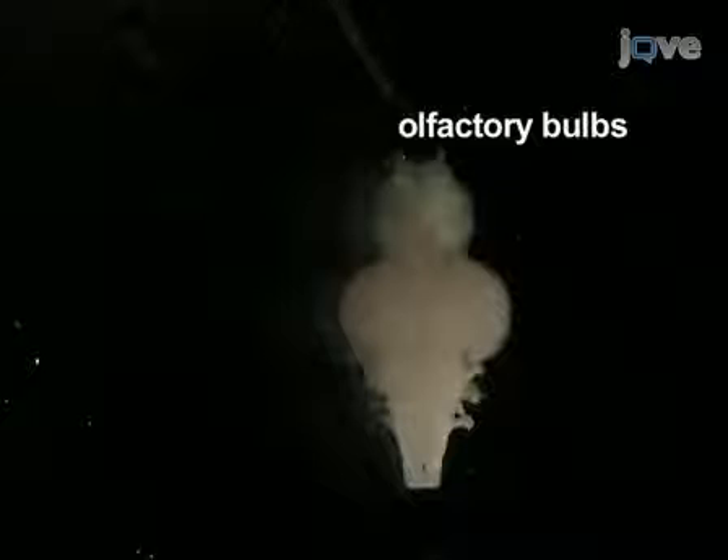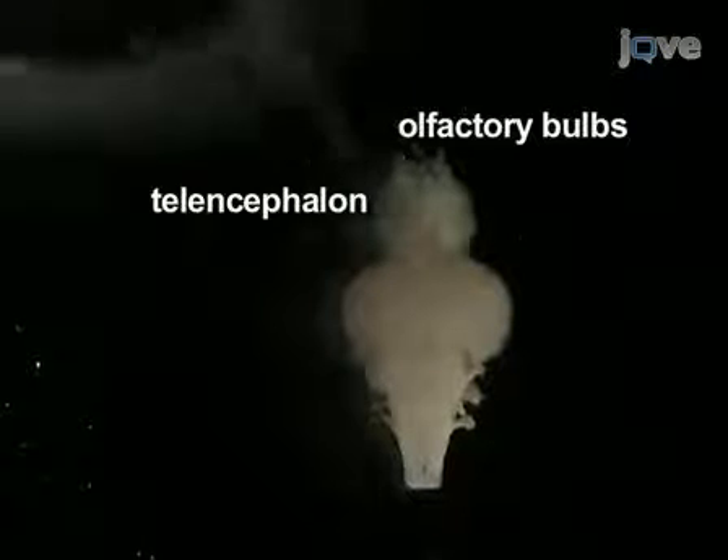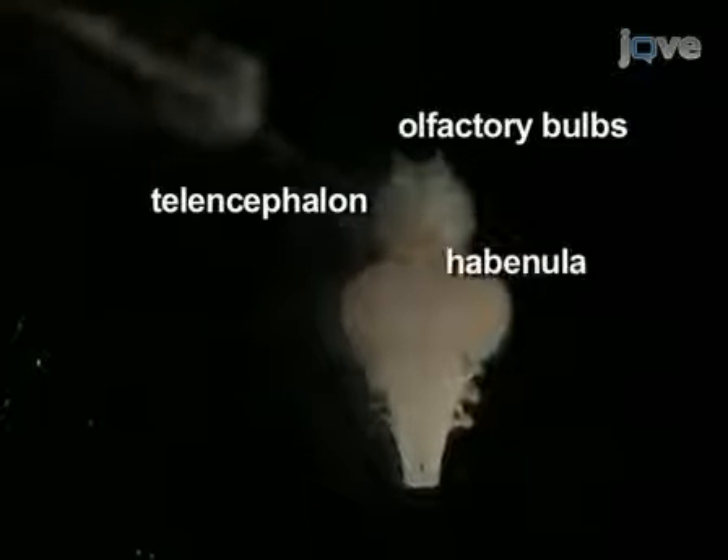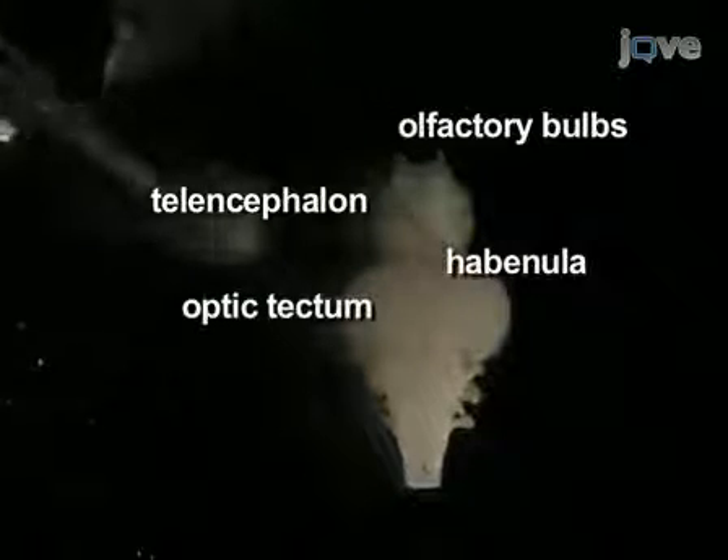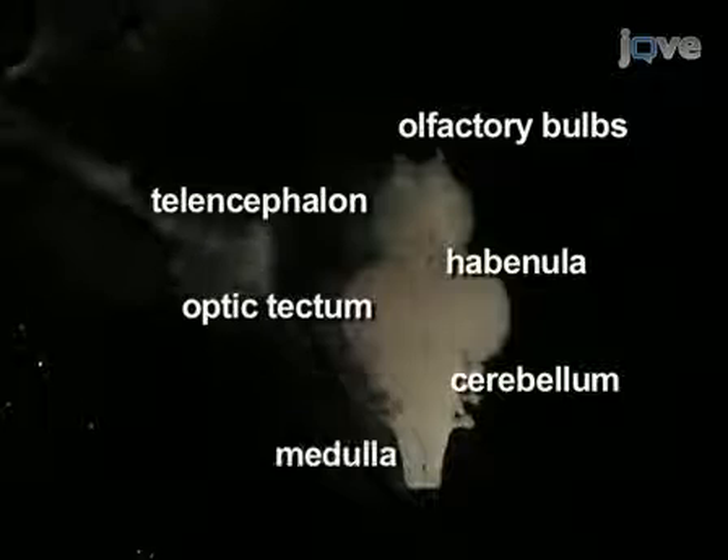Under the microscope, identify the olfactory bulbs, telencephalon, habenula, optic tectum, cerebellum, and medulla. Here are the olfactory bulbs, the telencephalon, the habenula, the optic tectum, cerebellum, and medulla.